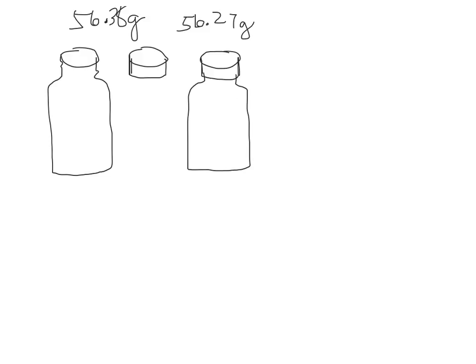This is one of the Alka-Seltzer ones. Now, if you had noticed, almost everyone in all 6 of my classes had the mass go down for the Alka-Seltzer. We haven't had any discussion on this yet. Oh, I didn't put a water level. Water level.